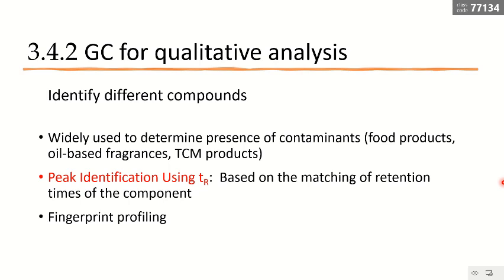We use exactly the same testing method or testing conditions, such as the same column and the same temperature programming method.